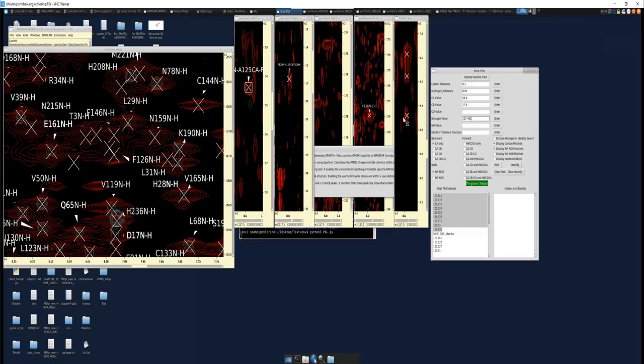So the idea is, as we discussed in the previous video, you will have shared NOE values. If this NOE is looking at its I-1, its I-1 will be able to see its I+1, right? So this filters this list of HNCA values with these NOESY matches.